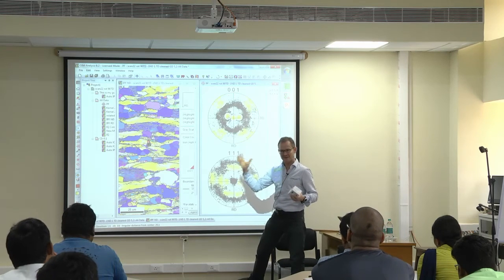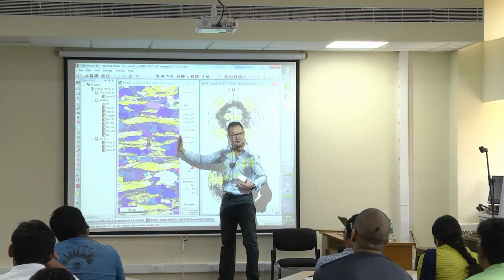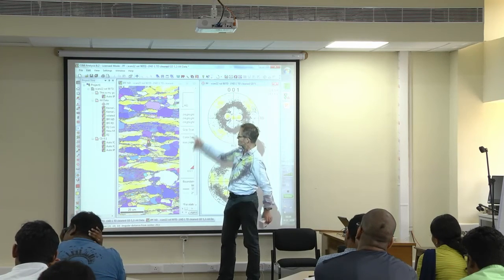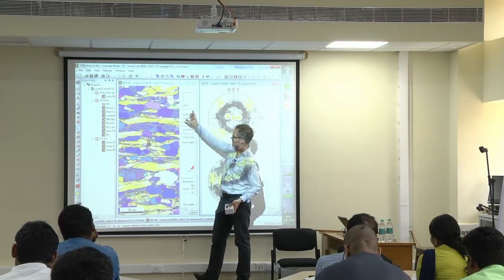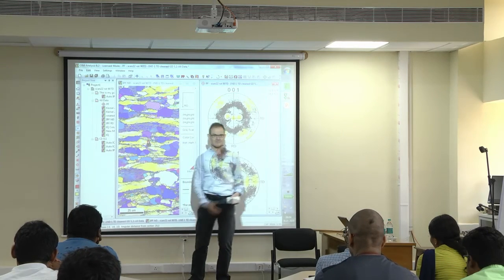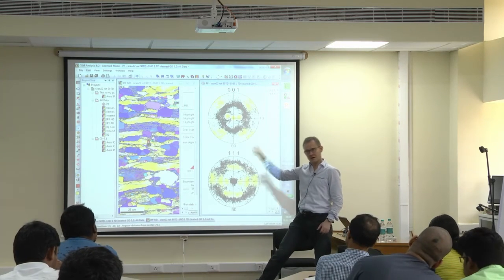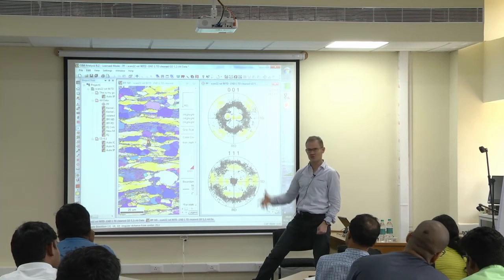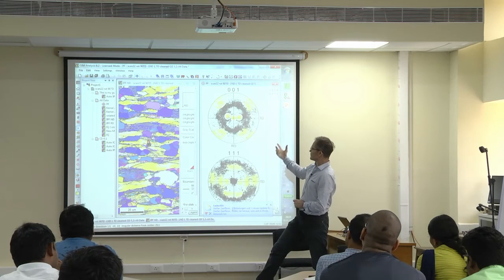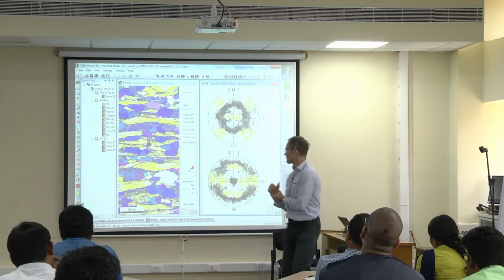So this is a relatively complex texture, but you see it actually separates then into deformed and non-deformed grains, into deformed and recrystallized grains, and you see the deformed grains split themselves up into one fiber like that and one fiber like that. And okay, of course, nowadays this is a solved problem, how these recrystallization textures of IF steels form, but you hopefully see and can follow how powerful the software is in order to allow us to explore that texture, no? These texture problems.